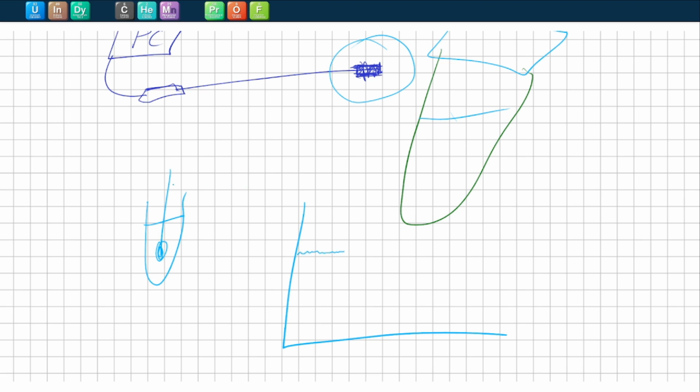At some point, after maybe about 30 seconds or so, you'll take the temperature probe out of the liquid, and as you do so, the liquid will start to vaporize, and as it starts to vaporize, the temperature will drop because it cools down the environment as it does so. At some point, the liquid will stop vaporizing because that's all the liquid that will vaporize, and then the temperature will level off again. This drop in temperature, that's what we're focused on. That will be the delta T, the change in temperature that we're going to be interested in.